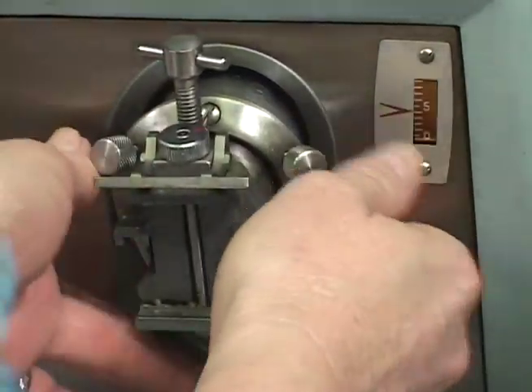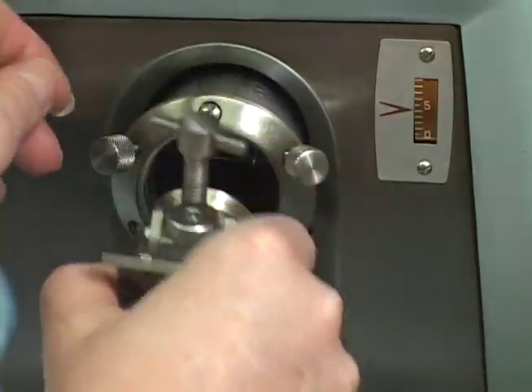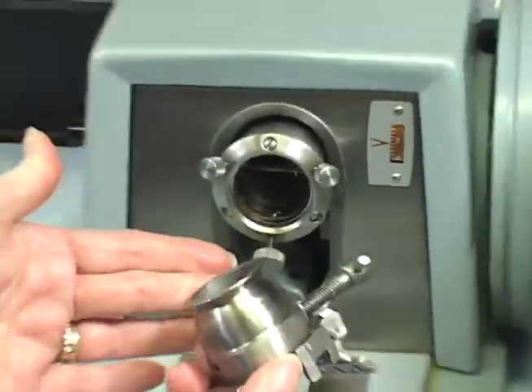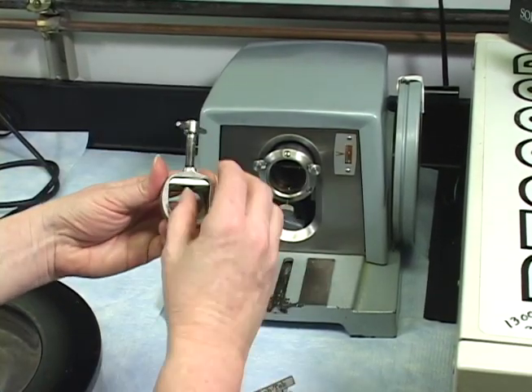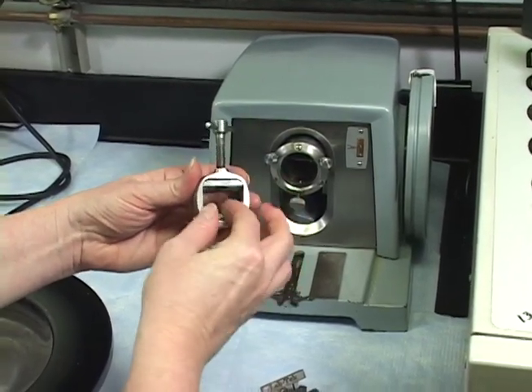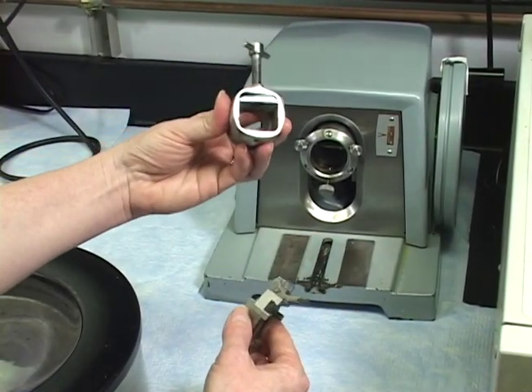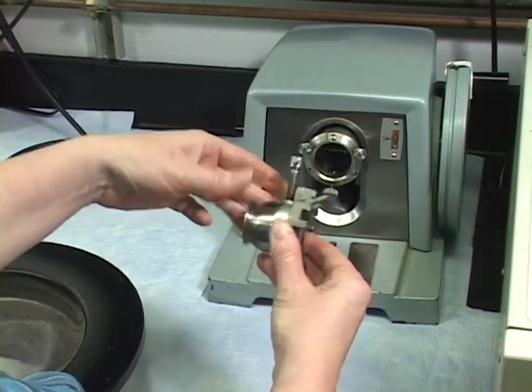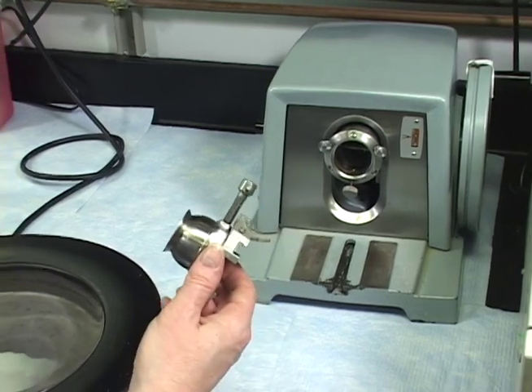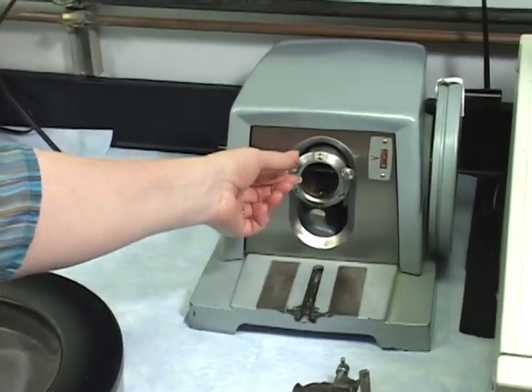I'm going to totally remove it. See, if you loosen these enough, you can actually take the whole unit out. And this is what's wrong with this microtome, is this whole unit. But I wanted you to get to see what it is. And this foot is not clamping correctly with this back unit. So it needs a whole other new one of these on this. It gives you an idea of what that looks like behind all this clamp. And here's the 3 knobs I was talking about.